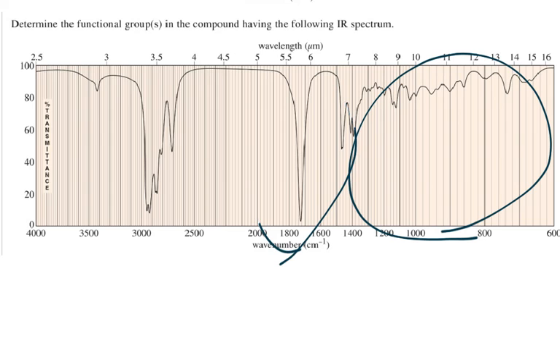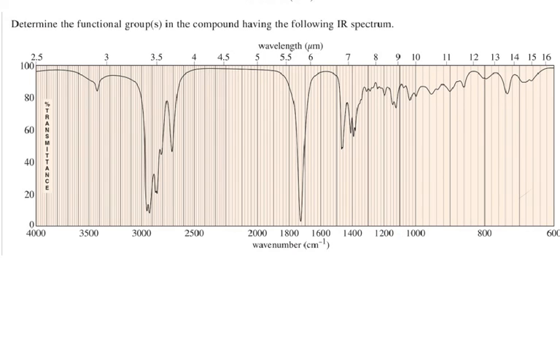And so all we really get out of this is that there's an aldehyde, but there's not an OH, there's not an NH. A lot of infrared spec is also what is not there. So there's no carbon-carbon double bonds, there's no NH, there's no OH, there's no terminal alkyne, but we do have an aldehyde. And that's how you read an infrared spectrum. That's basically all you can get out of it, and if you want more specifics, you have to go to other spectroscopy techniques.